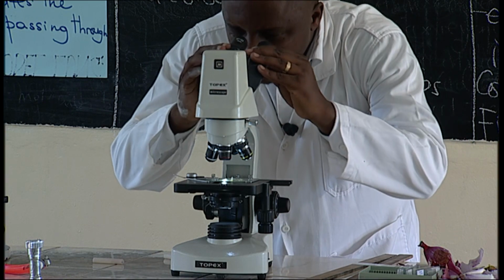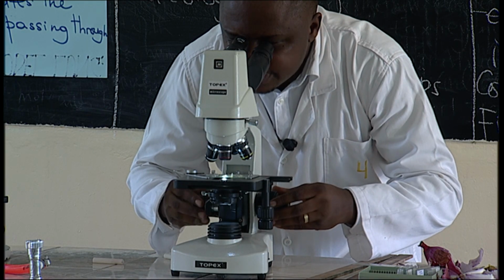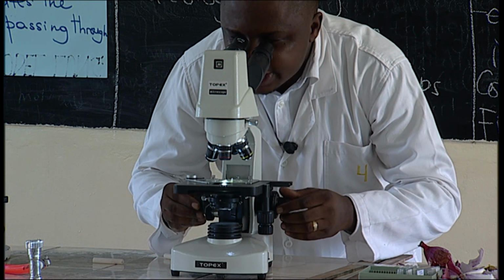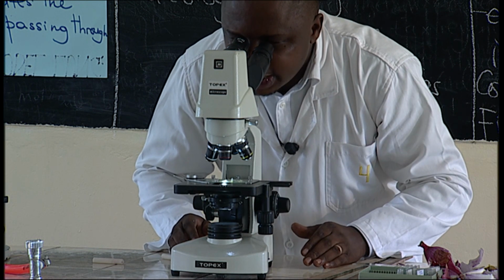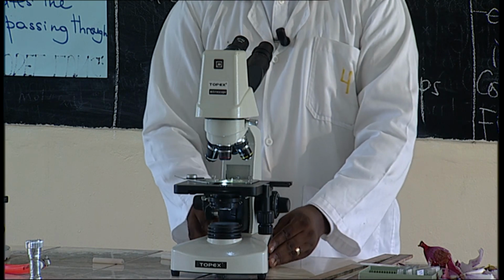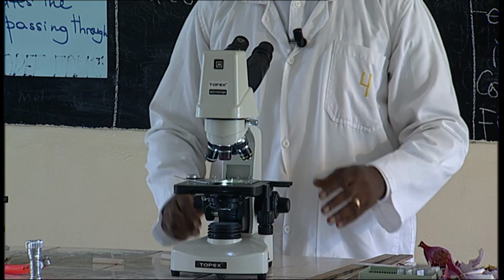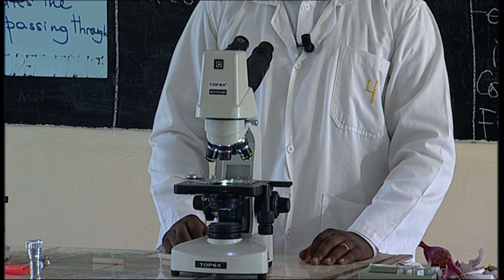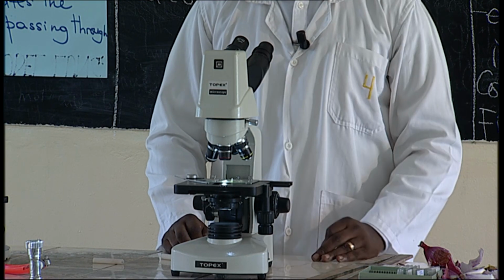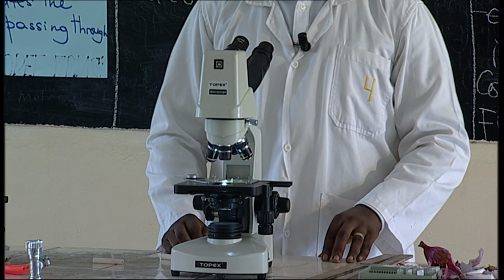Of course, you have to check, and then you also have to use the coarse focus knob and fine focus knob so that you can see the cells within the onion. Then after that, you are able to identify different parts within the cell. You can see the nucleus, you can see the cytoplasm, you can also see the outer membranes.